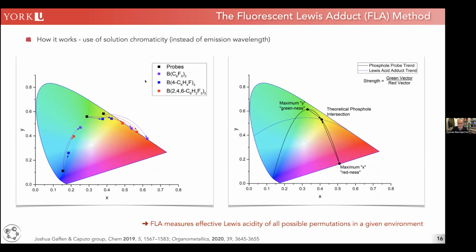And you can do the same for the Lewis acids that you coordinate. So here are 3 Lewis acids as an example. Here's the blue probe with a weak Lewis acid, a medium strength Lewis acid, and a strong Lewis acid. Here's the green probe, weak, medium, strong, and the yellow one, weak, medium, strong. Each of those sets, the blue dots, the red dots, and the purple dots, can be fitted parabolically. When you look at the probe alone and plot one of the Lewis acids on top of it, we actually have 2 parabolas that intersect, and they intersect at a point that is not a measured point.